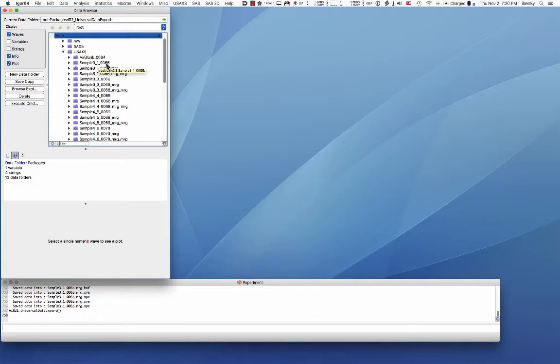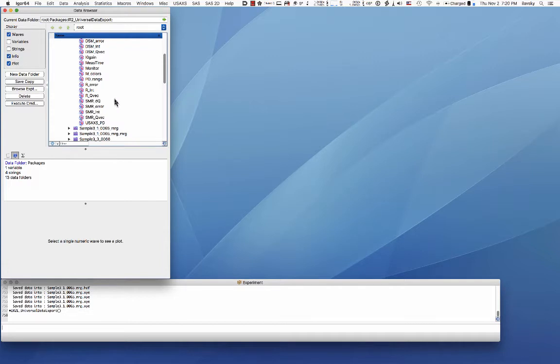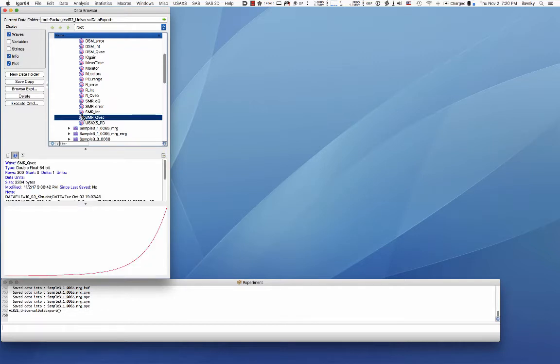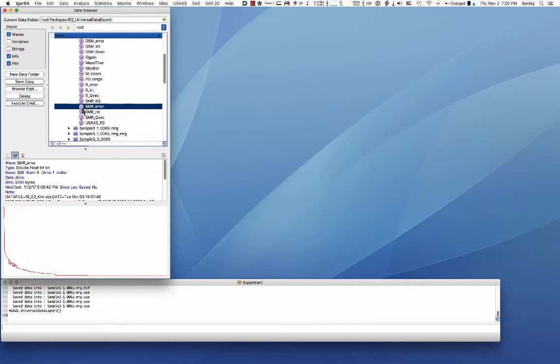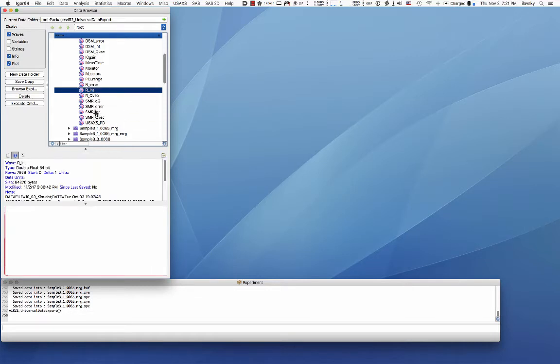There is a folder containing two types of data. There is a SMR_Q vector intensity uncertainty or error and DSM_Q resolution. These four are slit smeared USAXS data. Slit smeared USAXS data is what naturally comes out of our USAXS instrument. But they are slit smeared with a slit length which varies.